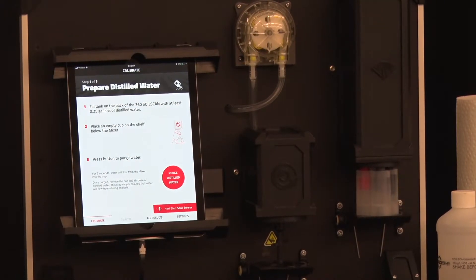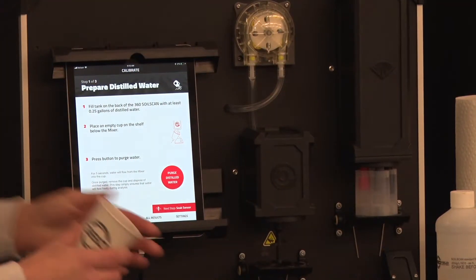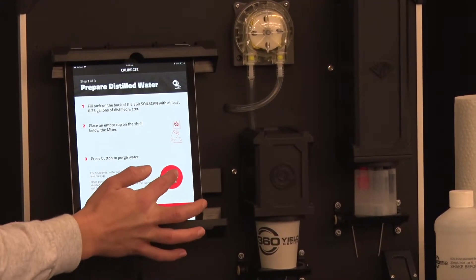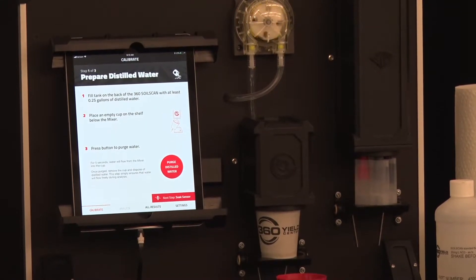Before using the soil scan you'll want to purge the system to ensure that there is distilled water throughout the lines. To do this, get an empty Dixie cup, place it under the mixing rod, and select Purge Distilled Water. The system will run, allowing distilled water to run throughout it.